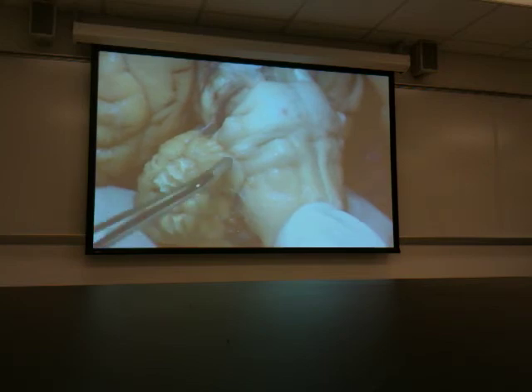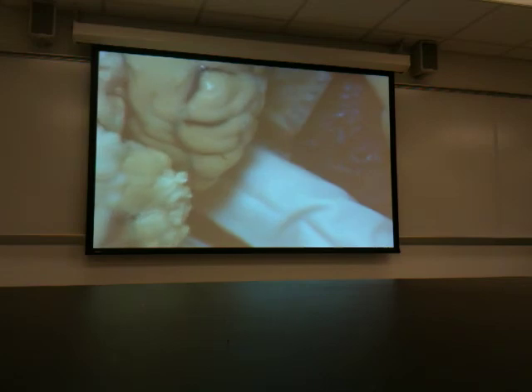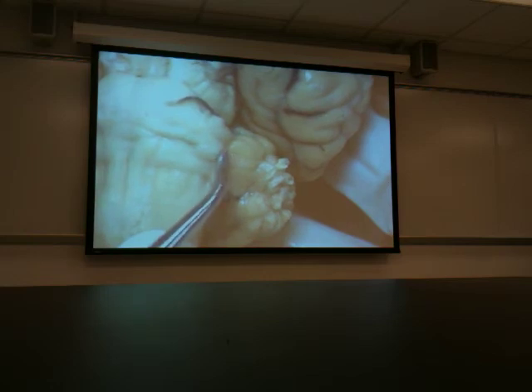These 2 stumps right here are your vestibulocochlear nerve, your auditory nerve. These 2 stumps are vestibulocochlear. This is facial, this is trigeminal. Okay, I go over here, I see a beautiful facial over here. Oh, you can see it? That's the disadvantage of going at such high mag. I get out of view real fast. But there we go, look at those rootlets. That's the facial nerve.